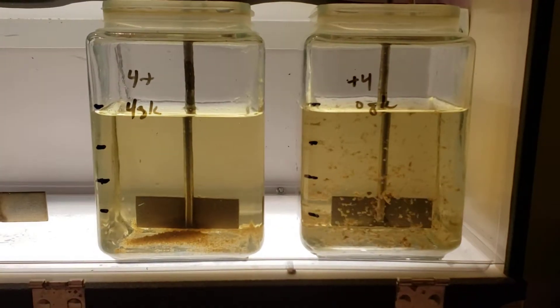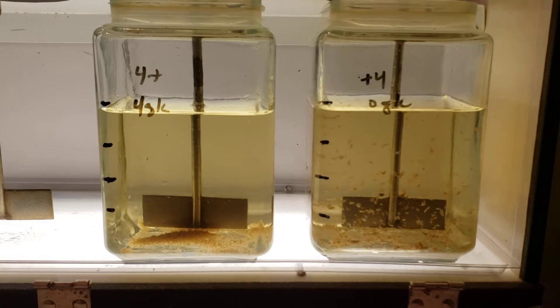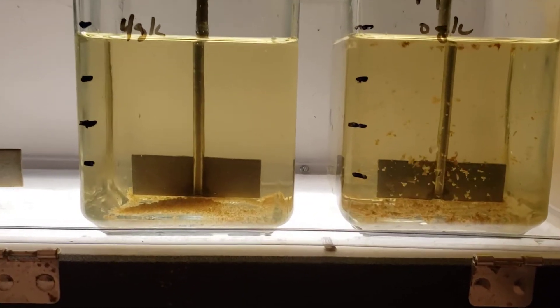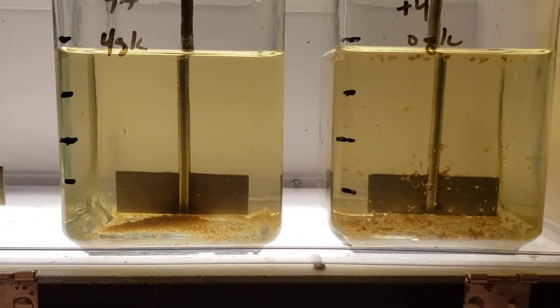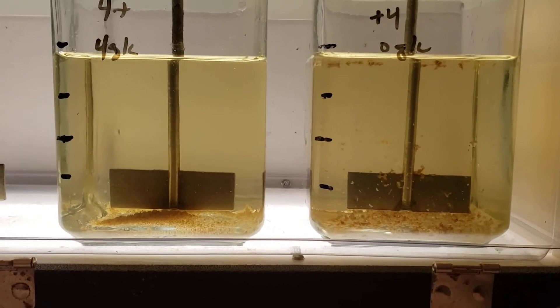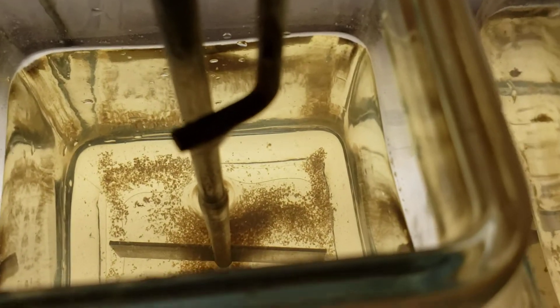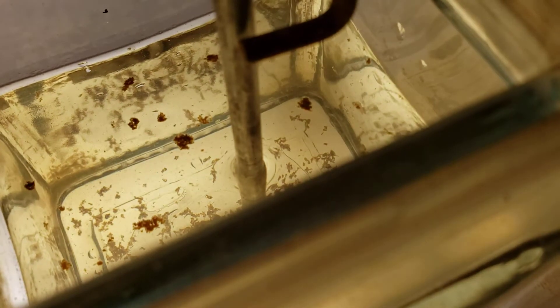We get rapid settling even at four grams per liter. In 10 seconds, without any sand we've just got some settling but a lot of floaters. There's a really clear top surface layer with the sand, and then several big floaters without the sand.